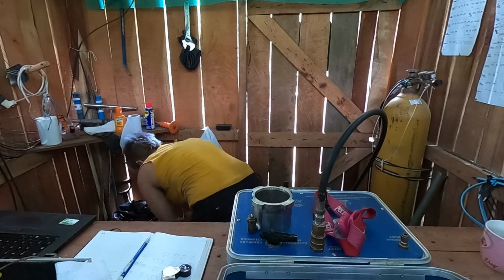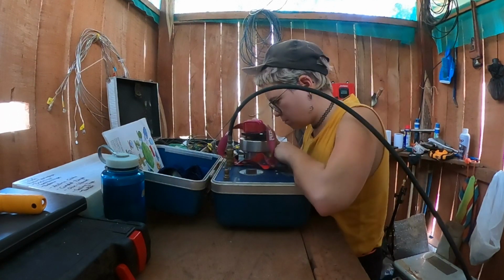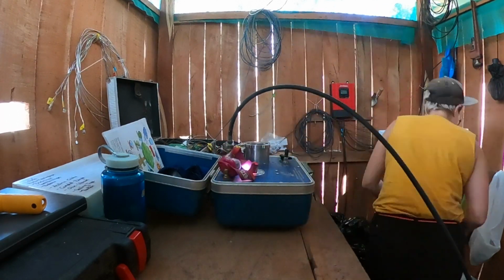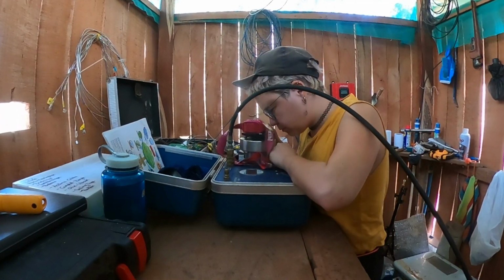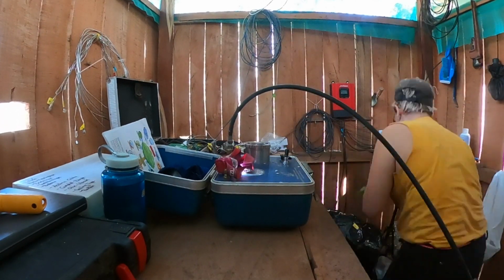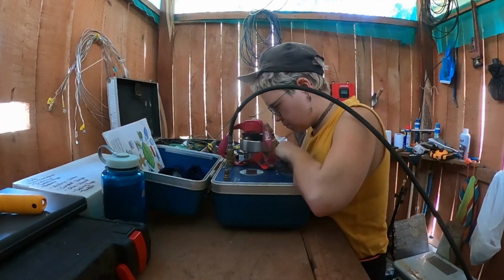And yeah, a day of water potential measurements is doing this 3 times per branch, 2 to 3 individuals per species, and then 2 times or even 6 times a day. So you can imagine that this amounts to a lot of measurements in one day.